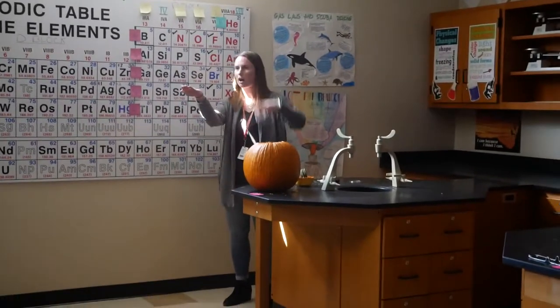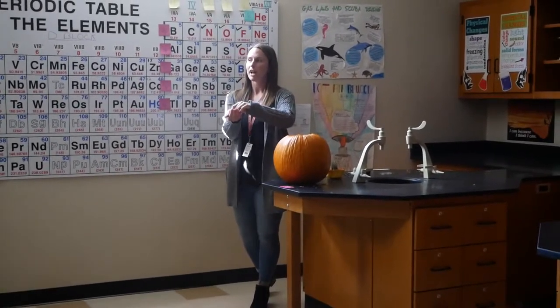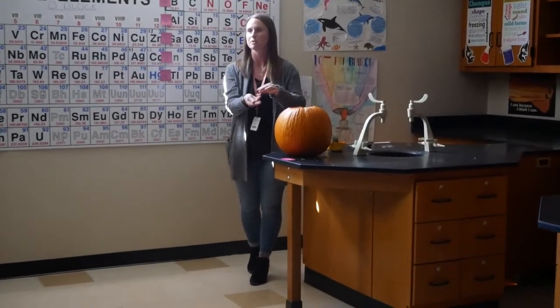We have calcium carbide — little rocks. We're going to drop these rocks in a thing of water that's inside the pumpkin. It's going to react and form a gas. That gas is going to build up in the pumpkin, we'll light the gas on fire, and that's what's going to cause it to pop.